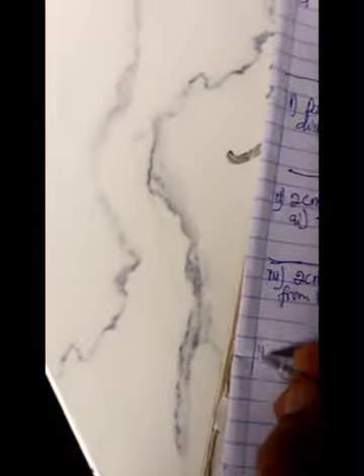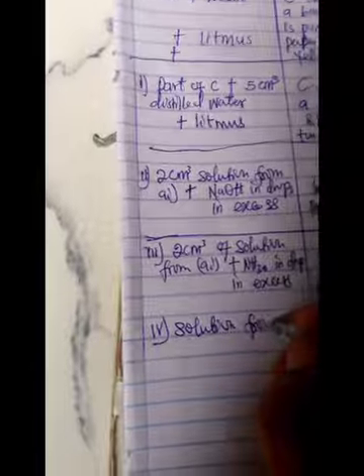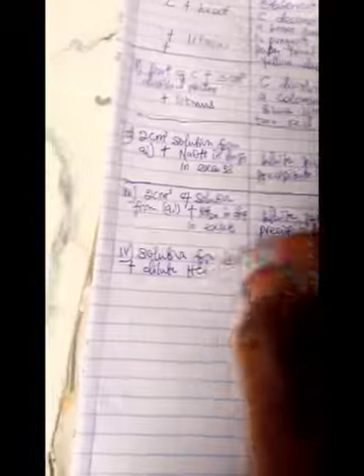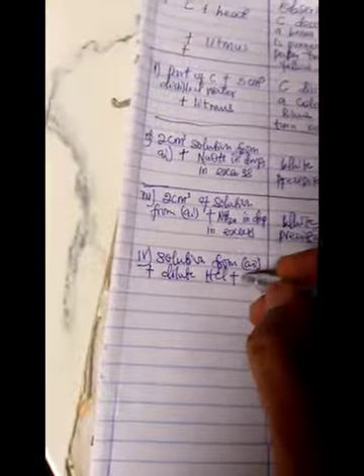So that will be our IV, and that is where we'll be using heat and dilute HCl. So we'll say solution from still AI, plus, what are we adding this time? Dilute HCl. When we add dilute HCl, what else do we do? We heat. When you add dilute HCl and heat, what will you observe?